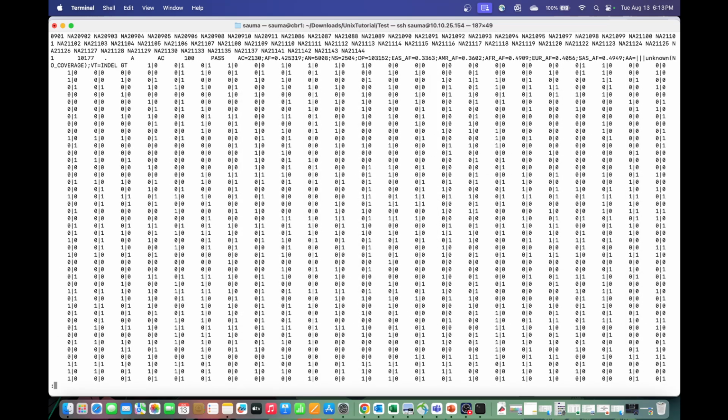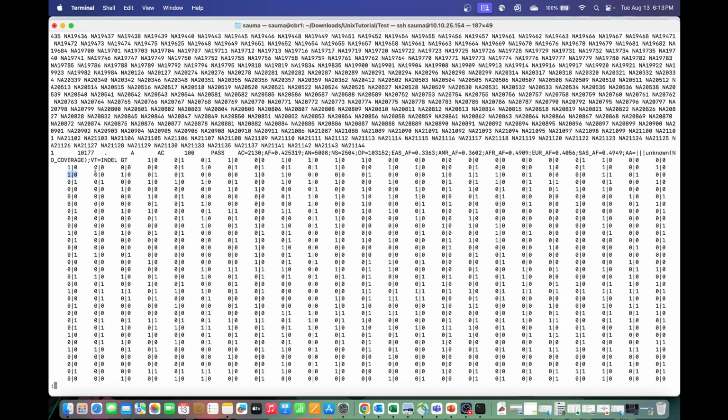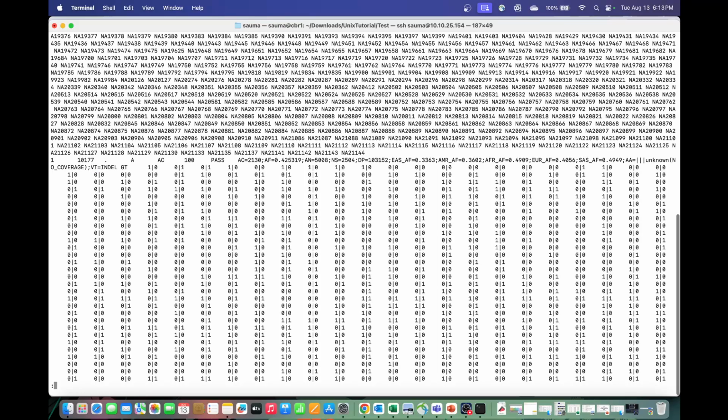So there are a lot of sample IDs, and this 1000, what it gives you, say for example, this is the first variant. So this is in chromosome 1. This is the position of the variant in chromosome 1. This is the reference allele. This is the alternate allele, meaning A has been replaced with AC. So basically, there's a C insertion in this particular position. Then PASS is basically the quality criteria for different kinds of callers. So this has been called by DRAGEN or any other kind of caller. So they give if the variant is a pass or a fail variant according to different criteria. They give it like this.